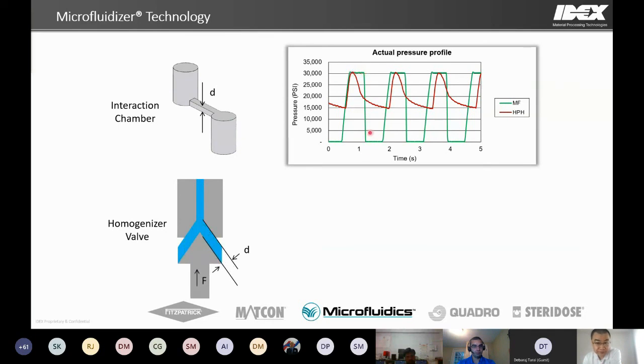The zero pressure period occurs when the plunger retracts and no sample is moved and processed during this time. So this period won't affect or lead to any interference with the processed material or results.